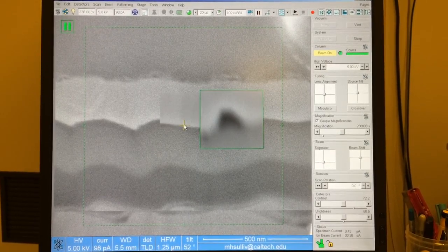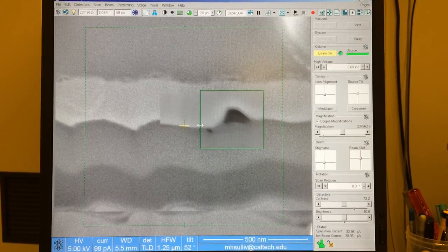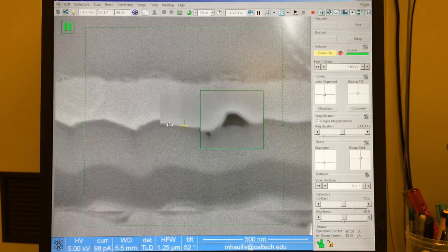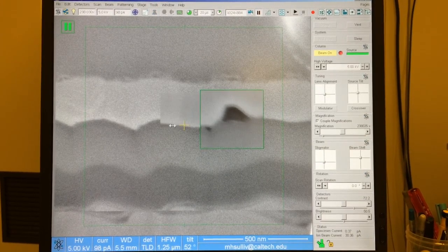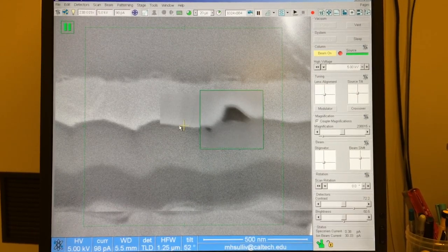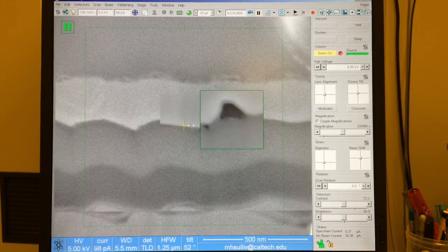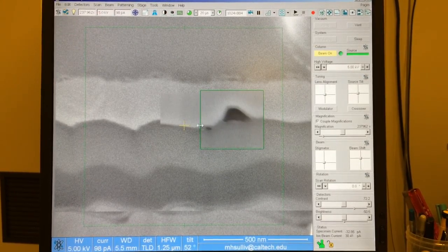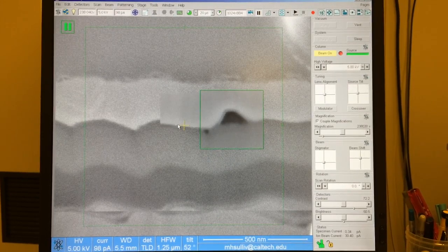So instead, for focus, what I like to do is start in the middle and then move only a couple centimeters to the right, compare that to a couple centimeters to the left, and ask myself which side is better. Comparing left to right, the left side looks a little better, so the optimal adjustment is somewhere to the left of the center cross. I'll move it just a couple millimeters and grab a frame, then iterate the process again. Comparing about two centimeters right versus two centimeters left, they look about the same. So if they look the same, I go back to center — and I've finished my focus adjustment.